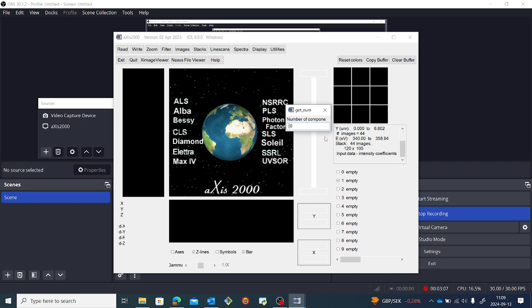So it's important that during the data collection, you have some preliminary knowledge about your sample, and while you collect the data, you also collect the data for your reference compounds. You can use these reference compounds to do the fitting. That's what we are going to do.